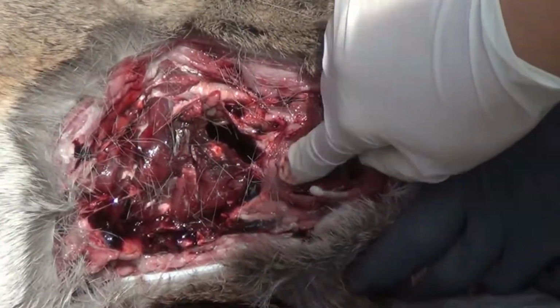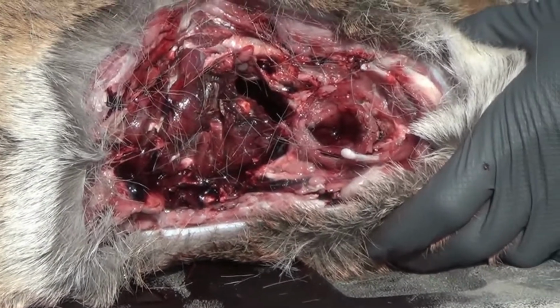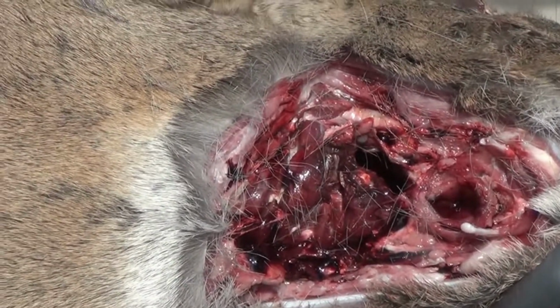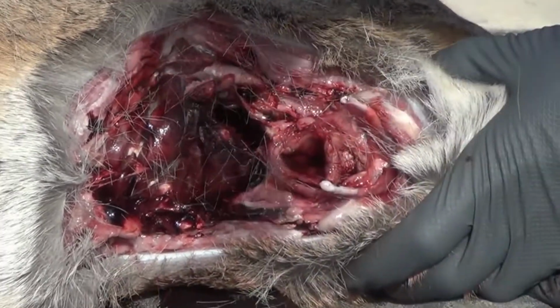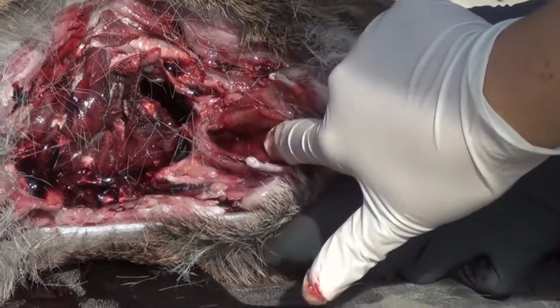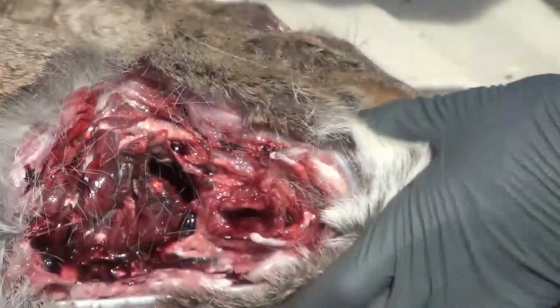our epiglottis. That is the tissue that closes when you swallow, so that you don't get food going down into your lungs. So this tissue right here, this little flap, it will point out at you. That is our epiglottis, and that tells us that we're right at that level of the larynx, which is, again, right where you swallow.